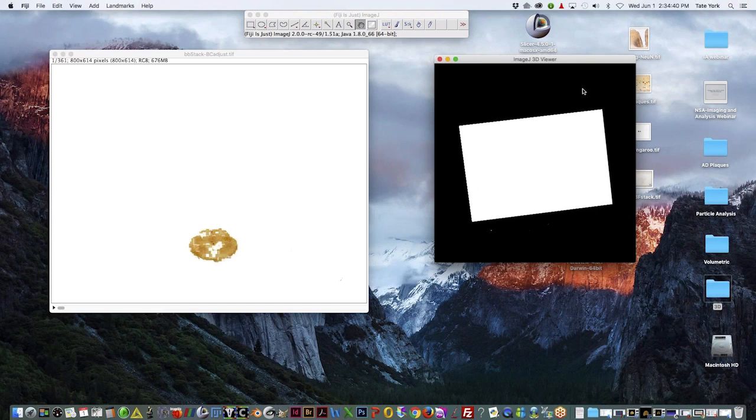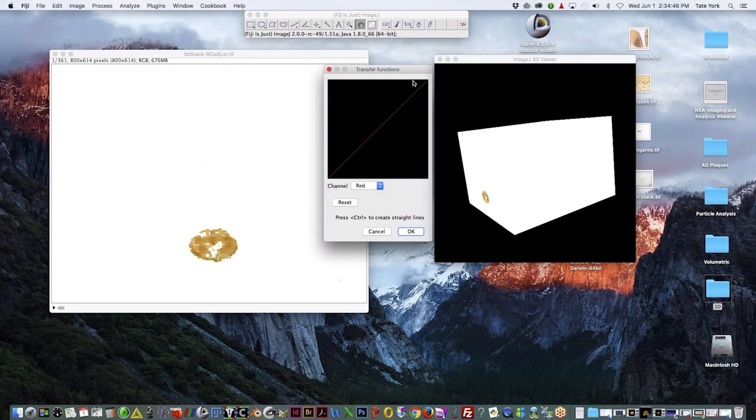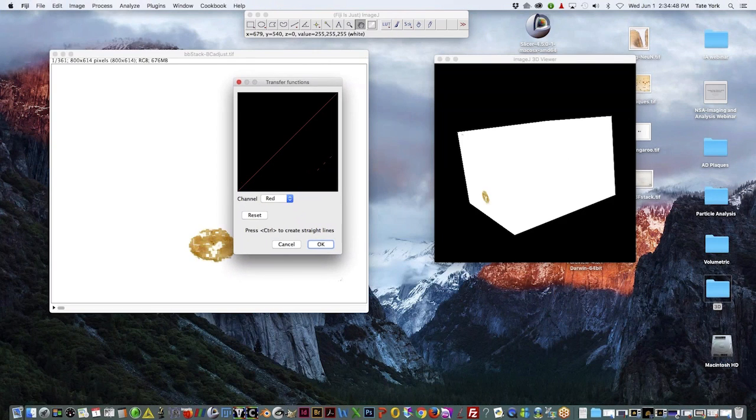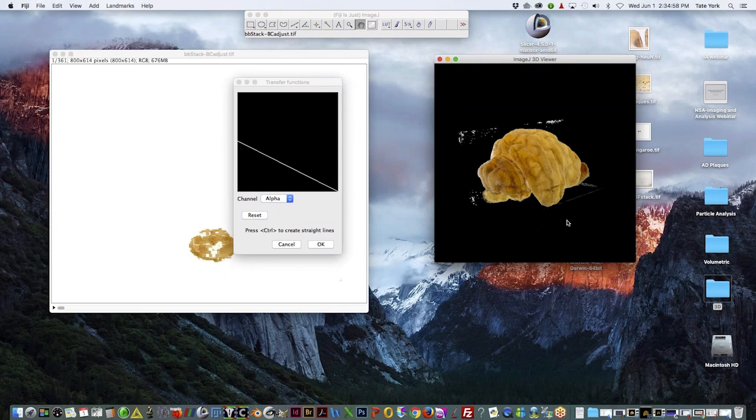And we'll see if I have to upload this one again. There's another feature in Fiji that we use. It's called Volume Viewer, and this allows you to section through at any plane and view it in any plane.